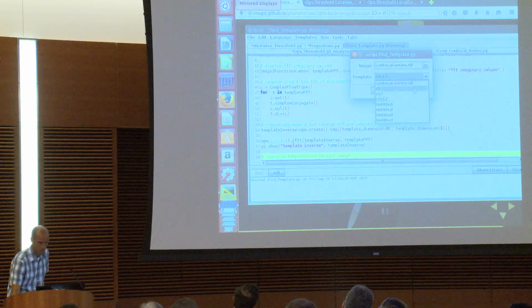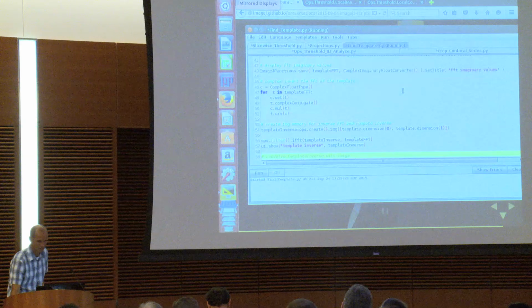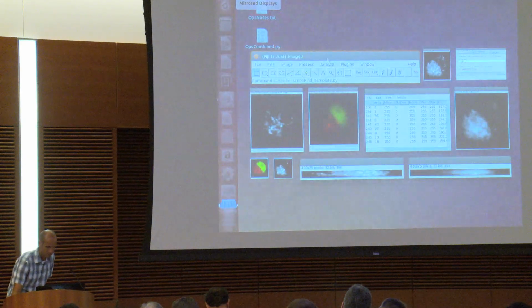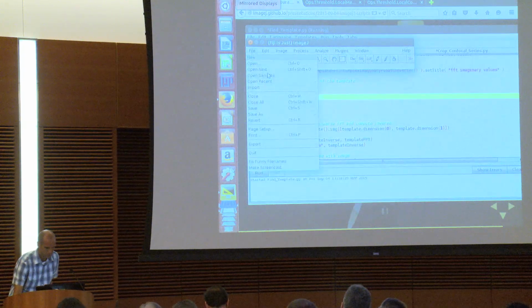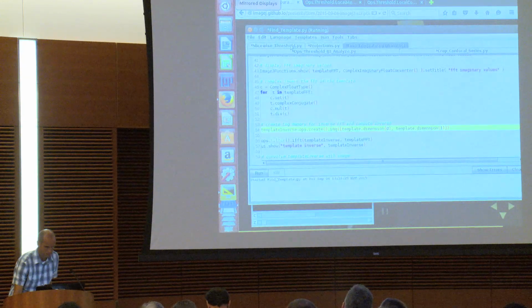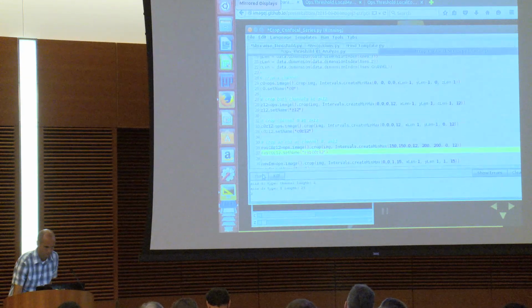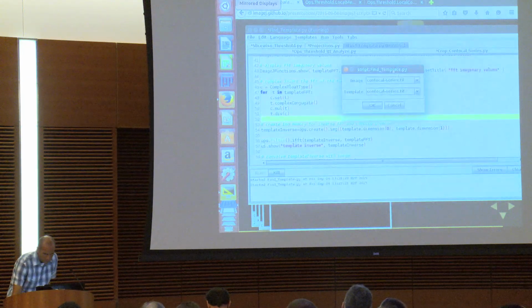Okay, I actually don't see the title. Yeah, I'm not sure if you closed down your extraneous images. Just very quickly see if I can. Here they are. Maybe I just lost it somehow.